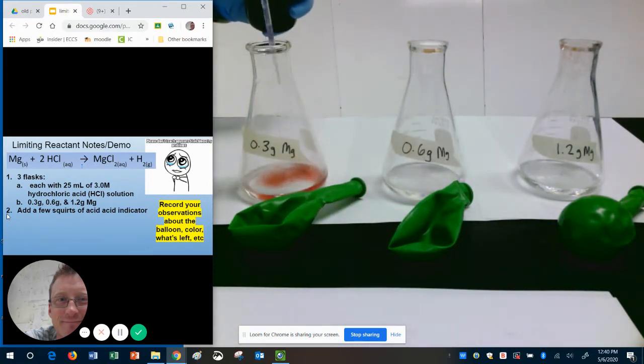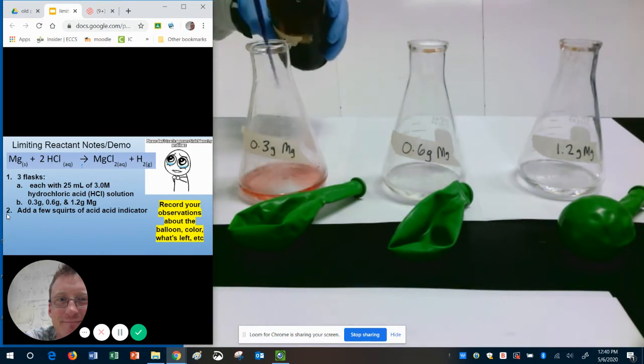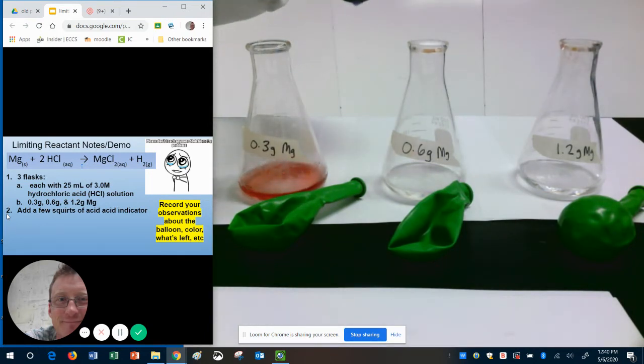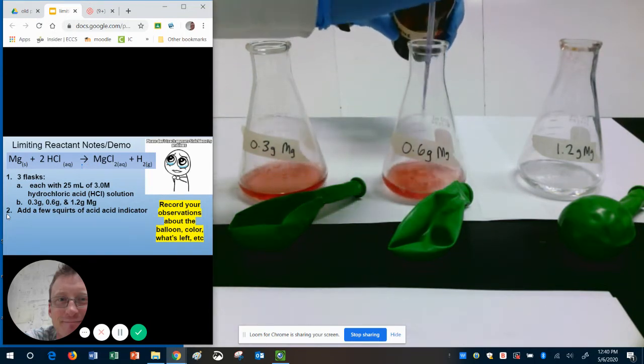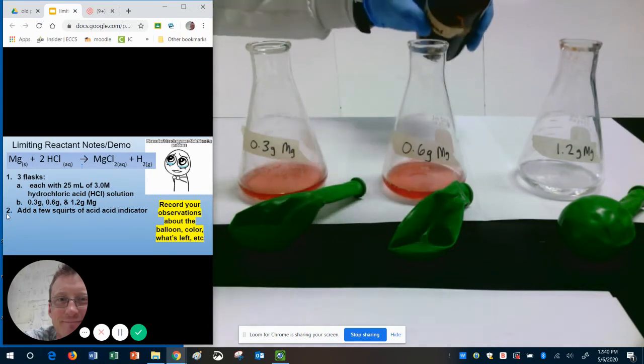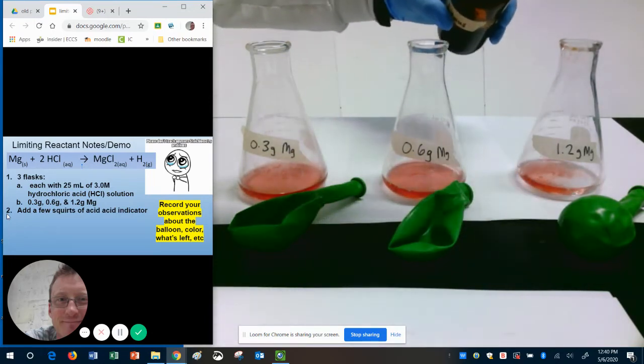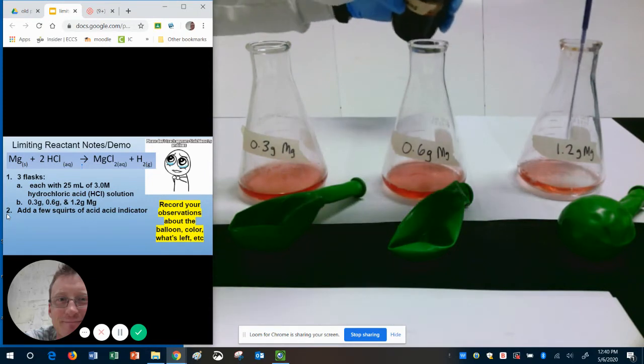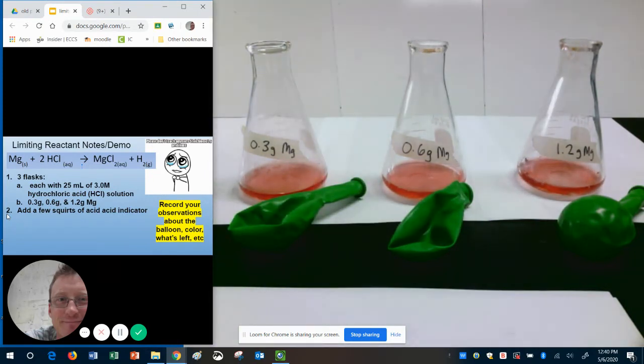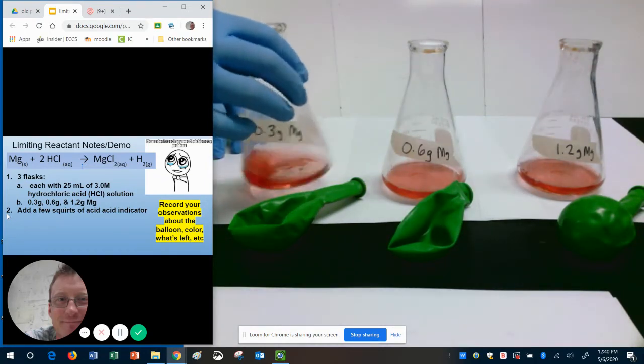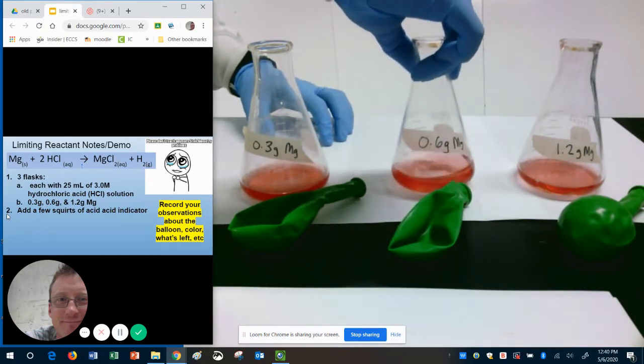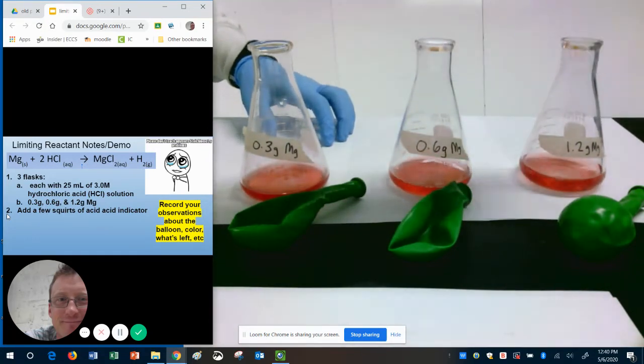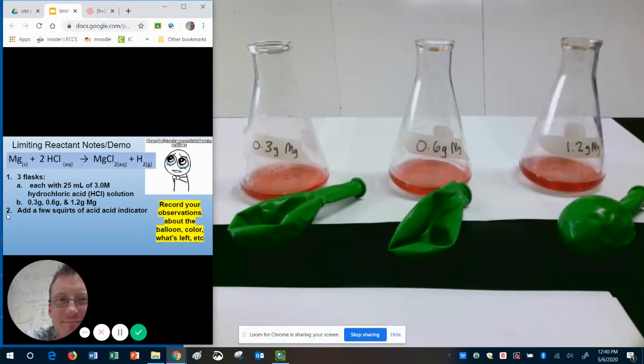So I'm going to put a squirt or two of indicator into each of these containers. Again, each of these has 25 milliliters of hydrochloric acid, hydrogen chloride, HCl. Those are all different ways of saying the same thing. So they all have the same amount of acid in them. And when you see that, this indicator, if there is any acid in our liquid, it will have that pinkish-reddish color.